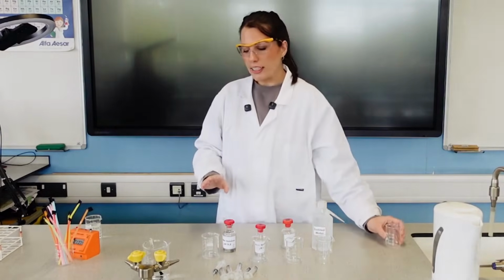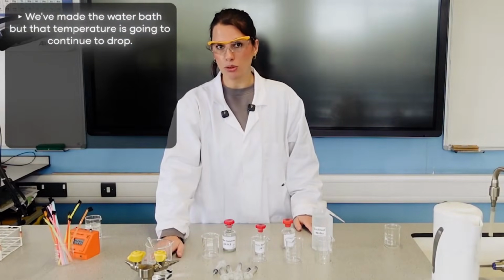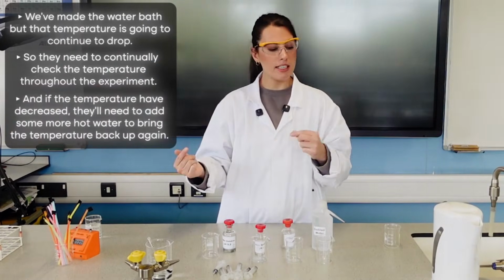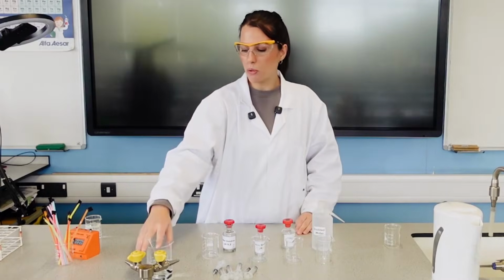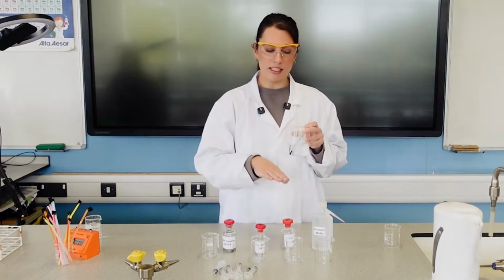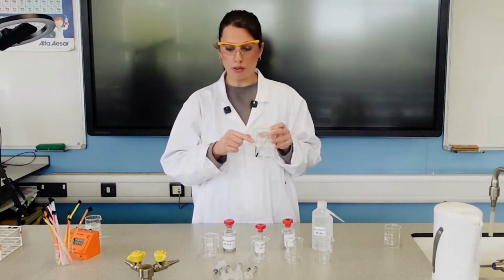One thing to point out to your students is we've made the water bath, but that temperature is going to continue to drop. So they need to continually check the temperature throughout the experiment. And if the temperature has decreased, they'll need to add some more hot water to bring the temperature back up again. So that's my water bath, and that is to control the temperature to make sure it's only the different pHs. That is the variable we are deliberately changing. That is our independent variable. This is our control variable.